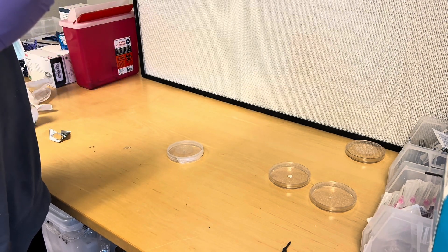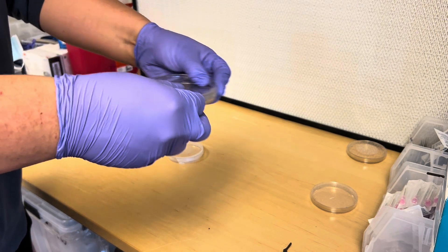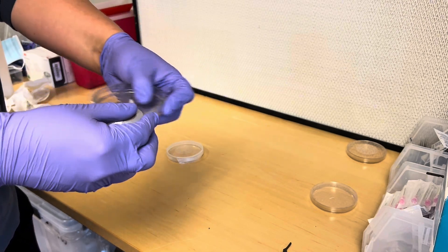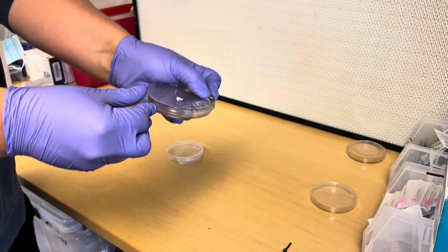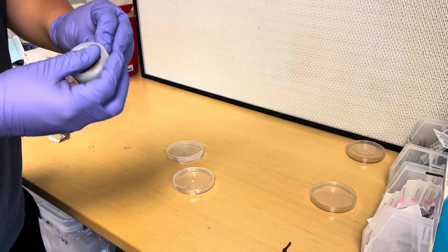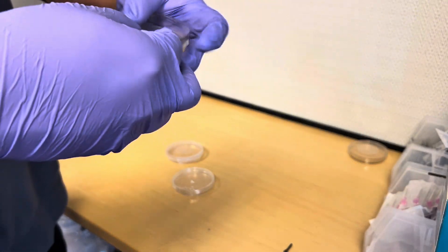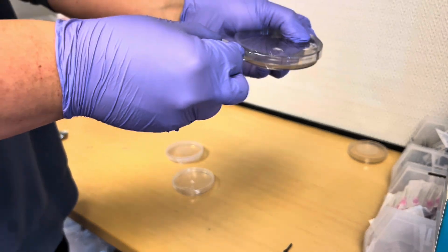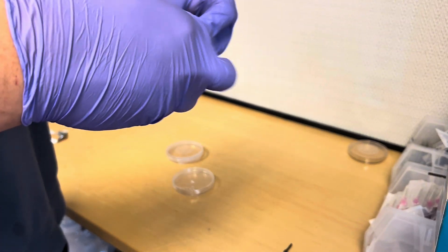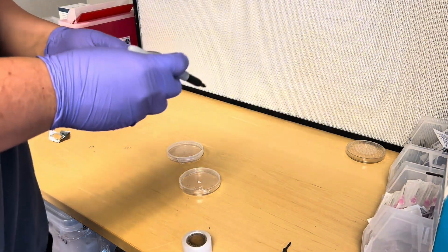But grafting tape is so much better. It's a little hard to get started, but once you get it going it's so much quicker. Same concept — just wrap it around the plate. You only really need to wrap it two or three times. I used to be paranoid and overwrap it, but two or three times is enough. Grafting tape on Amazon — go get it. It's so much easier versus parafilm, which rips way too easily.